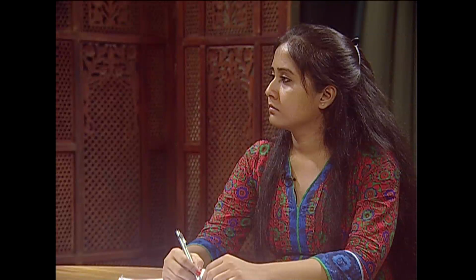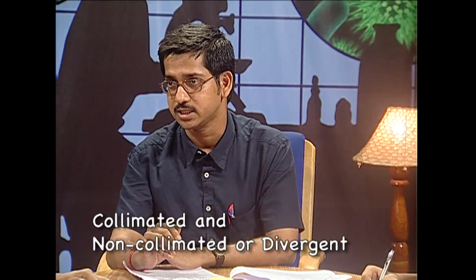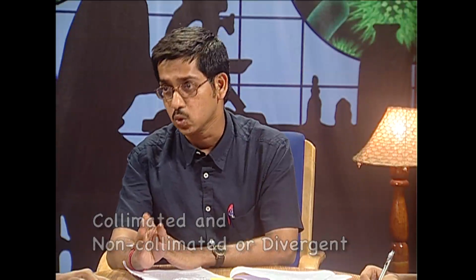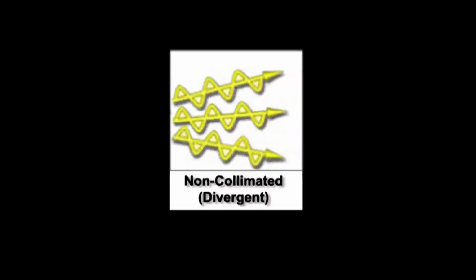Now, coming to the direction of propagation of light from the source, it can be categorized into collimated and non-collimated beam. Collimated beams are those light rays which are coming in a single direction, parallel to each other. Non-collimated beams move in different directions. So, if I want to have a focused light, a collimated coherent beam is the best source of light. And this can be nowadays obtained using lasers, which I will introduce you in the later part of this course.